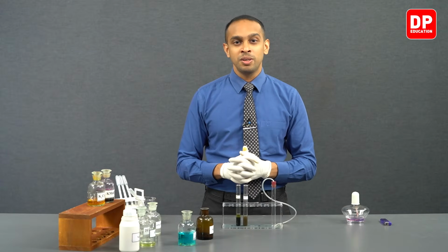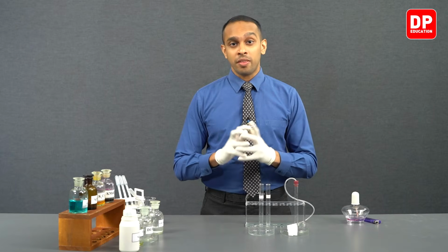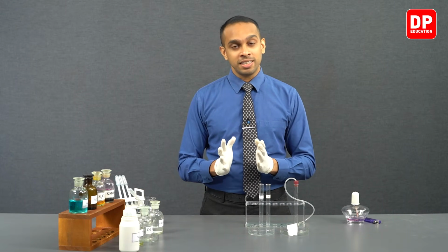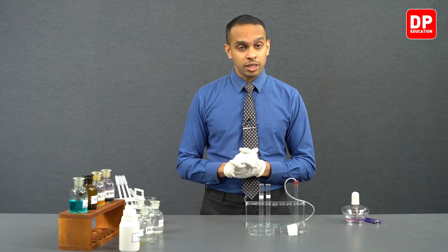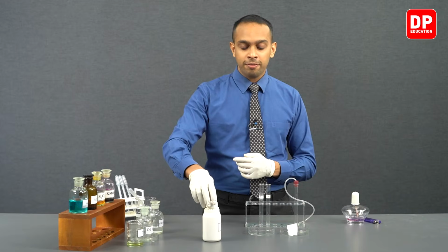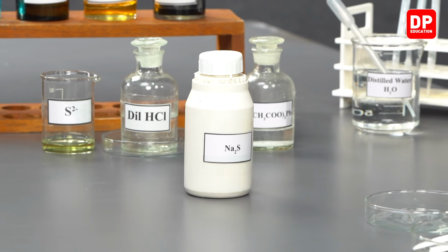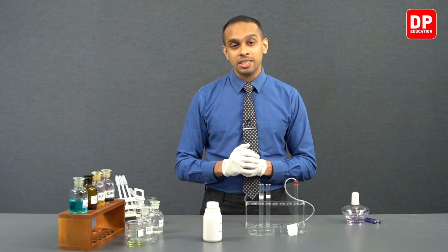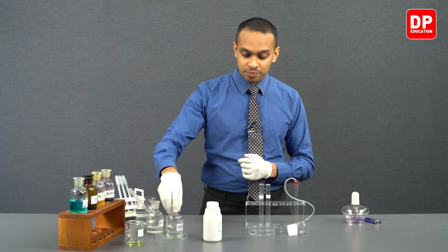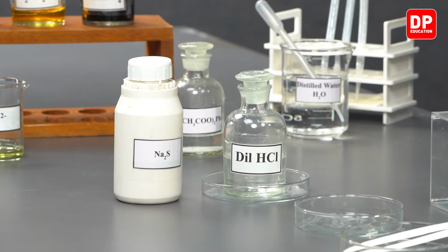Now let's move on to the next part of this experiment. Now we are going to take a look at another experiment that can be used to identify the presence of sulfide ions. For this experiment, we are going to take solid sodium sulfide. If you take a small amount of solid sodium sulfide and react it with HCl, you're going to see formation of hydrogen sulfide.